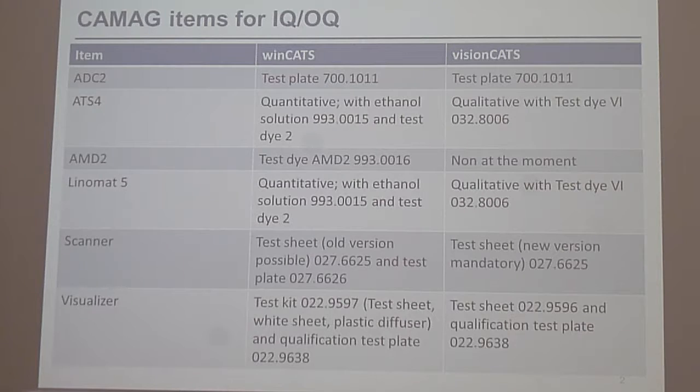Yeah. The thing is, if you have too much on it, it is no longer this Gaussian peak that you have. So yes, but the other thing is, as I said this morning, this chain of qualification has to be closed. And so if we now would say, yes, just put some phenacetin in some ethanol and mix it together, okay, then they would say, yeah, give me the certificate for that.